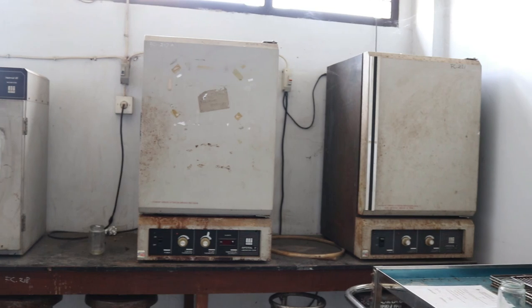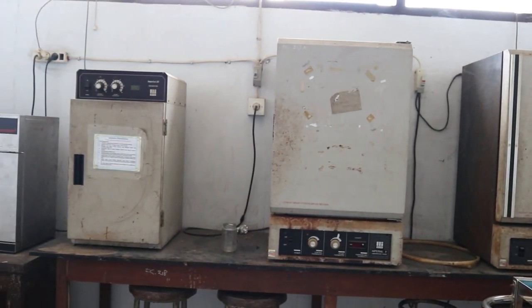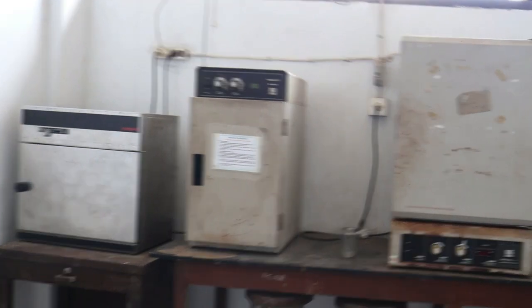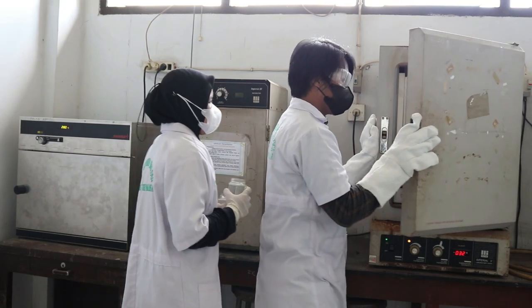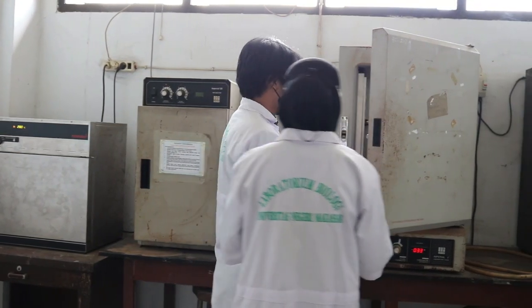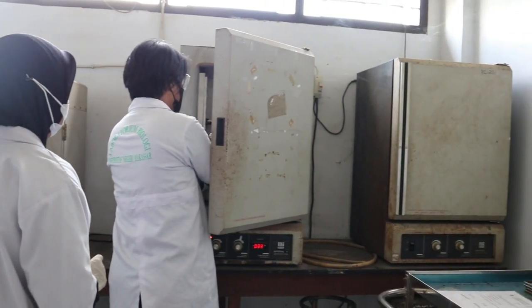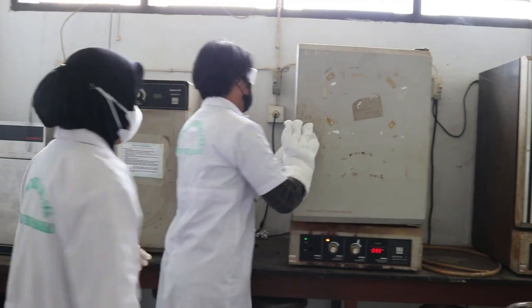Begin by connecting the oven to the laboratory's power supply. Once everything is in place, hit the on/off button. Wait a few moments for the device display to light up. You can then change the temperature by clicking on the temperature button. You can also change the timer to suit your needs. You can now add the sample to be incubated. Wait until the process is finished according to the timing.